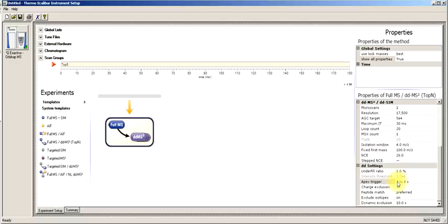So if it looks like we did another measurement, assuming we're doing an MS1 scan every second, 1 second later we find an increase, but it's not a really steep increase, and a second later we find another steep increase, but 3 seconds later we see that we're starting to decrease, then this peptide may have just exceeded its apex. It's going to select that for fragmentation.